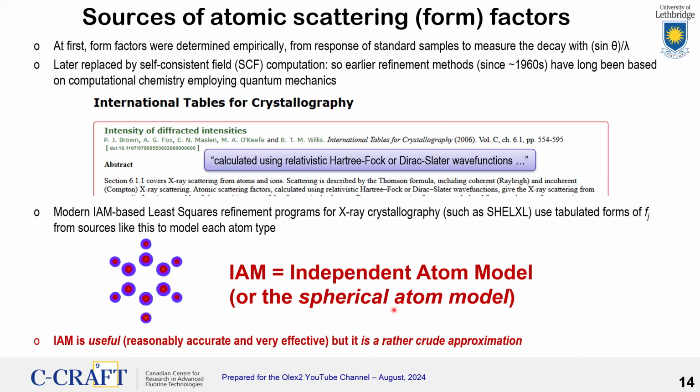I try to explain this to my students by saying it's like the ideal gas law is to thermodynamics for crystallography. So, as you all know, the ideal gas law has been known for about 200 years, is known to be inaccurate. And at best, it's about 1% accurate.